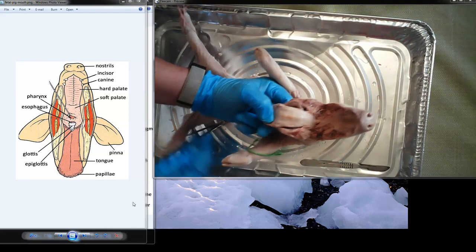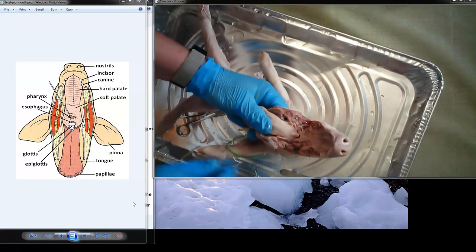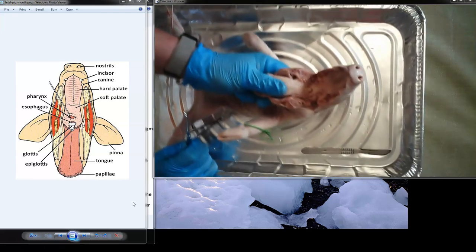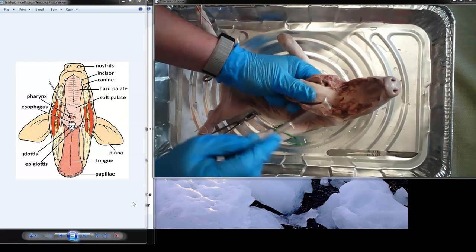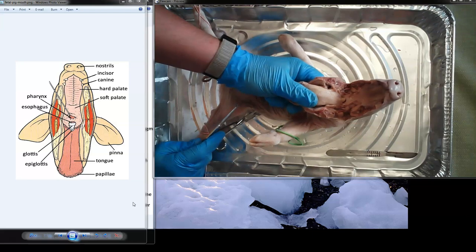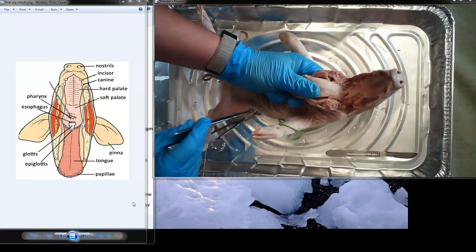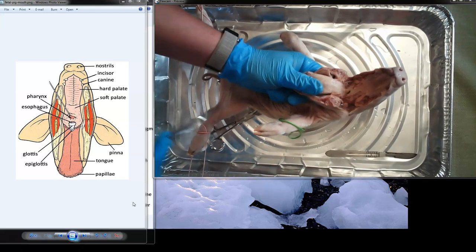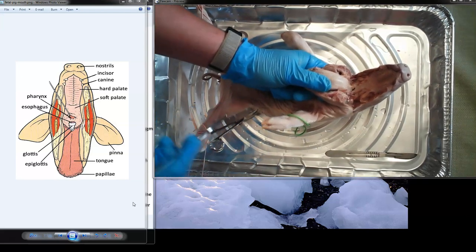It's not saliva. The liquid that's in here, maybe this is something that's good to talk about. The liquid that's in here is not saliva. This pig would only make saliva if it was alive. Because the pig has been dead for a while, it's not actively making any of the body chemicals anymore. That liquid that's in there is the special liquid that they put inside the pig to make sure it doesn't go bad, to make sure that this pig can stay in a vacuum bag for years, 2 or 3 or 10 years, and it doesn't get eaten by bacteria or fungus or insects. So that's the liquid you were telling us about. That's right. Okay, so there's our mouth.